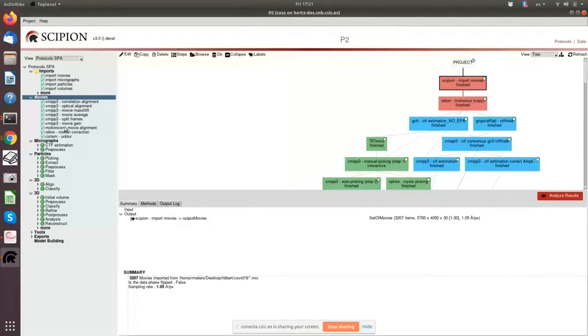So you have RELION's motion correction, MotionCor from MotionCor2, and then the one from FlexAlign from Xmipp is here, but you have it only in the development branch, not in the release one. Actually, there will be a Scipion 3 release very soon, in about one month or a couple of months, and all these algorithms will be released. But if you want to use them, you can have access to them by installing the development branch. Actually, it is not called devel, it is called python3 migration.